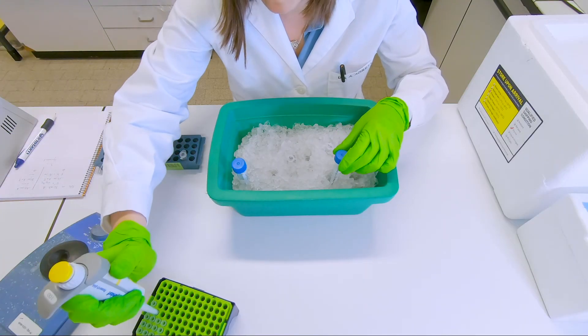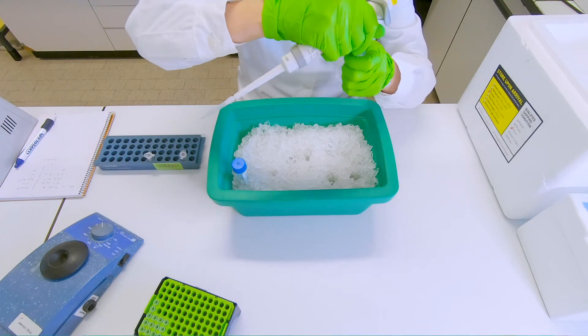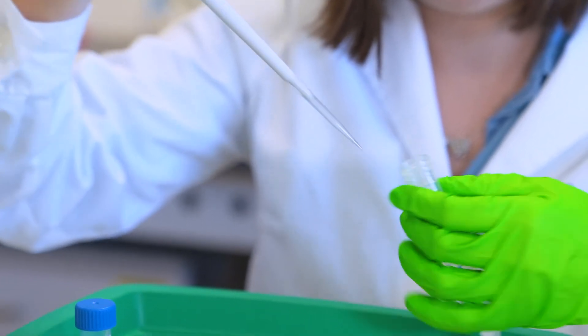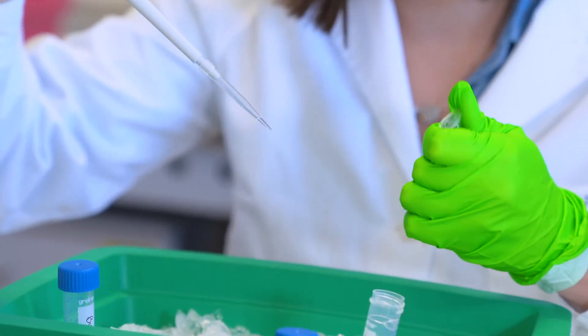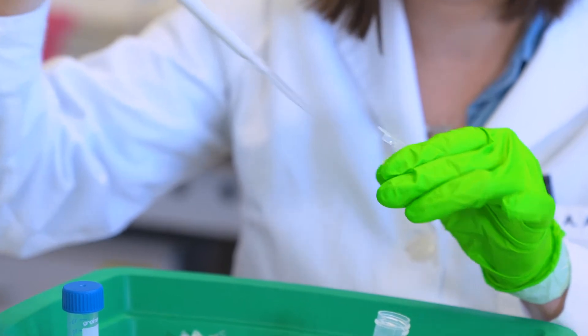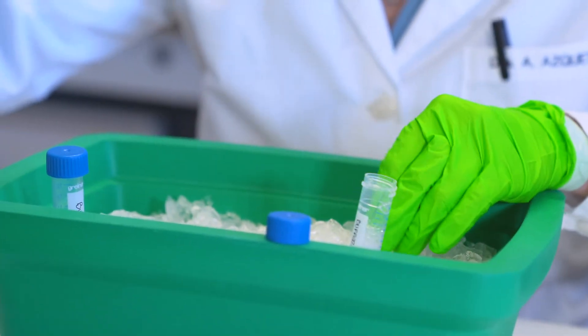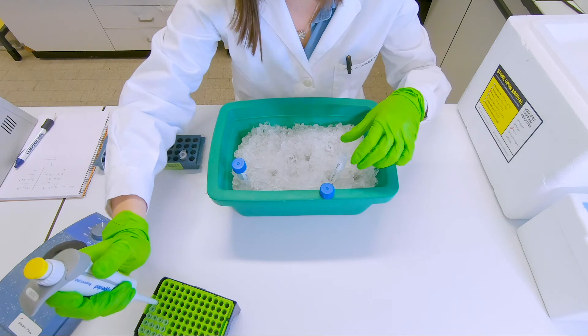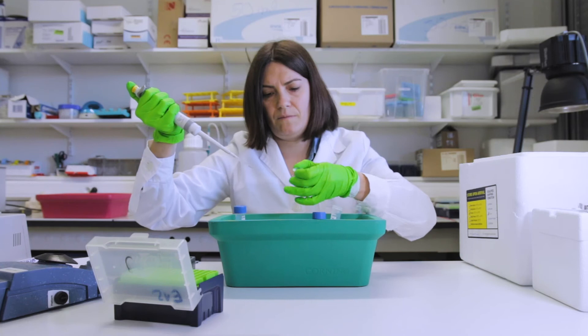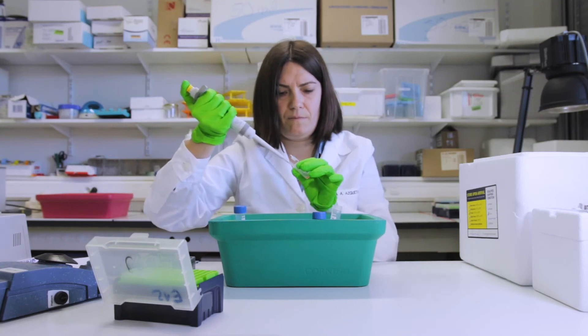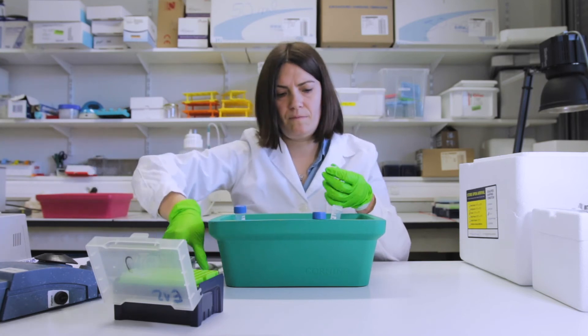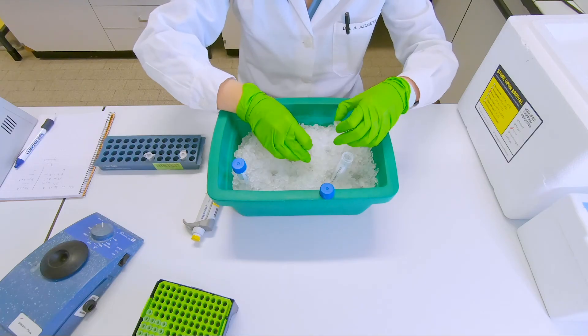We add buffer A with tritone X. The tritone X is a detergent to help with the lysis of the cells. To the aliquot of 50 microliters that we added on top of the cells, we will now add 15 microliters of buffer A with 1% tritone. And to the tissue, since it's double the amount, so to the aliquot of 100 microliters, we will add 30 microliters of buffer A with 1% tritone X. Both will be vortexed again.